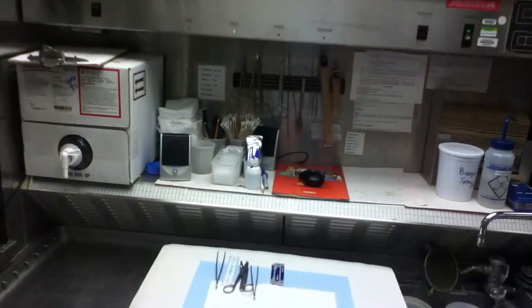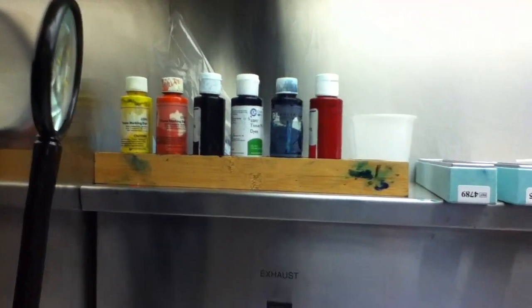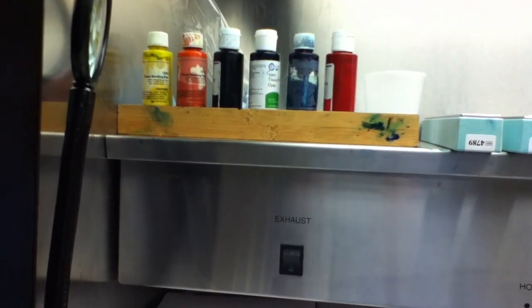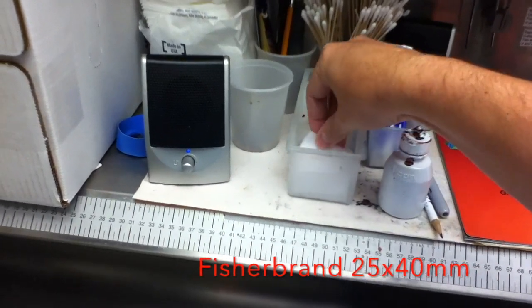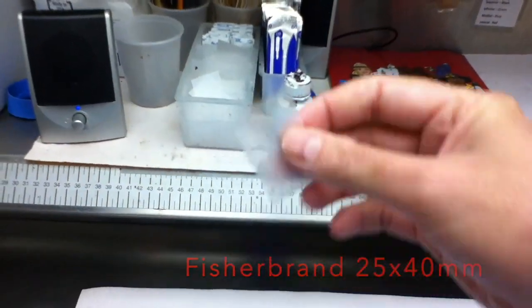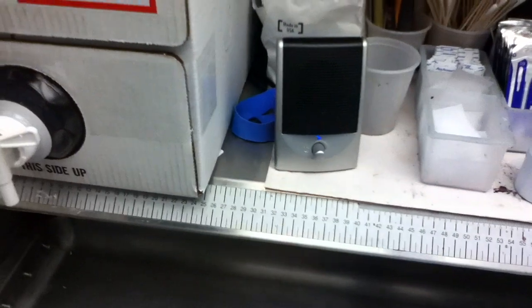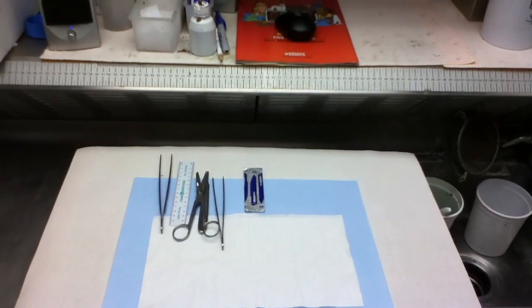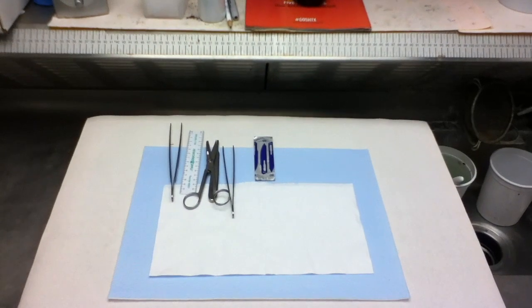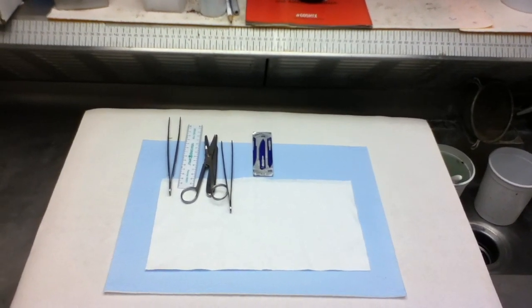The inks I'm using are from Cancer Diagnostics — that's just the brand this place uses. Davidson Marking Systems are good, and Stat Lab I've used before and they're pretty good too. I use standard biopsy bags for biopsies. We do whole-mount prostates here, so I use bigger blue bags for those, and that's what the stapler is for — securing those bags closed after the specimen is inside. Hope everyone enjoyed it; I'm going to try and do another video soon about ways to make your grossing bay more comfortable and easier on your body for standing long periods.